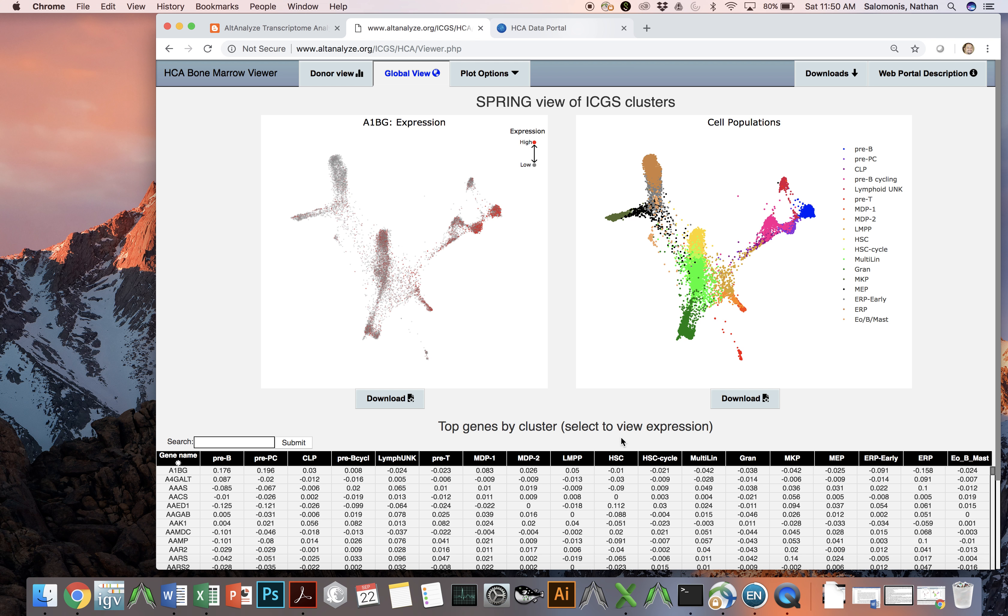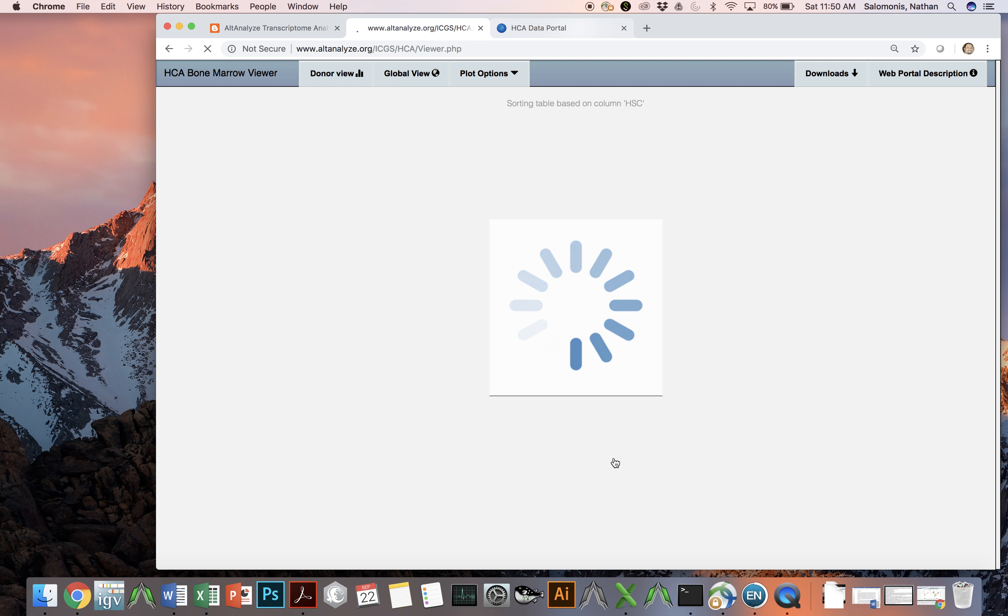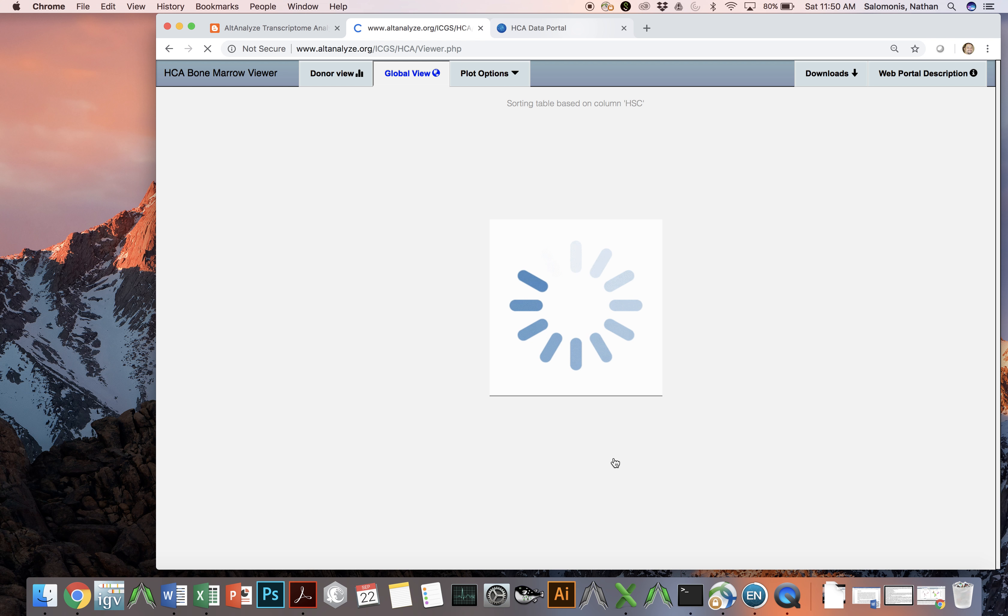In this viewer, you can simply click on a heading below, and then the table below will sort to identify the genes which have the most specific expression in that particular cell population.